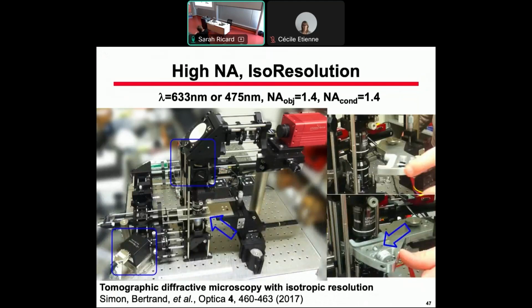We took our regular system and replaced the stage holding a regular preparation with a glass slide, etc. We changed this with a rotating stage. It's nothing else than a small stepper motor. It's connected via this cable to an optical fiber, which is properly adjusted so that when we rotate this, the optical fiber arrives exactly in the middle between both objectives. And now we can perform pictures.